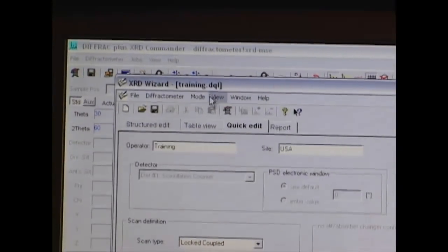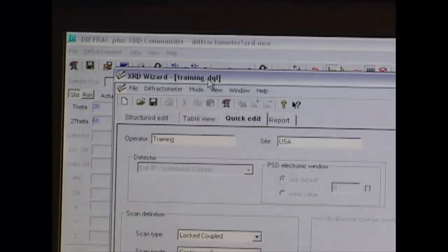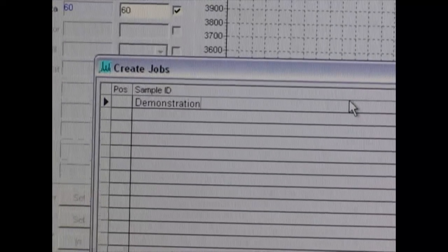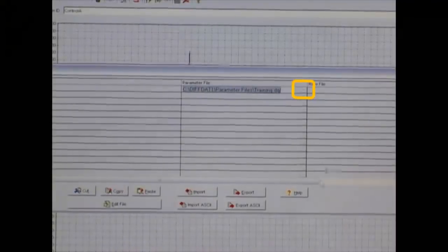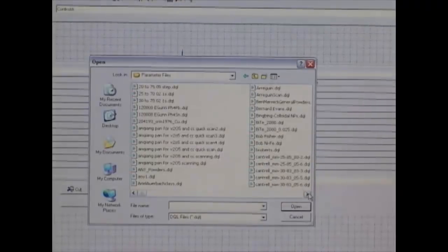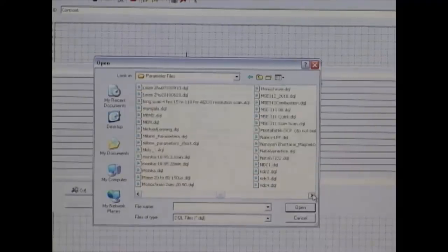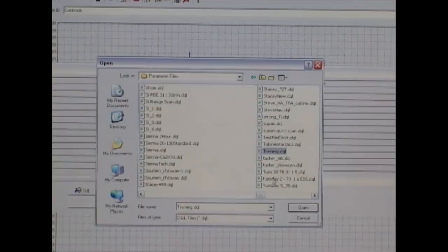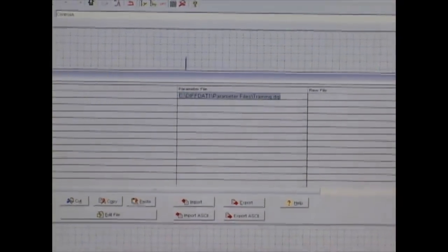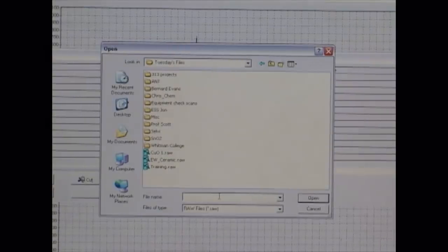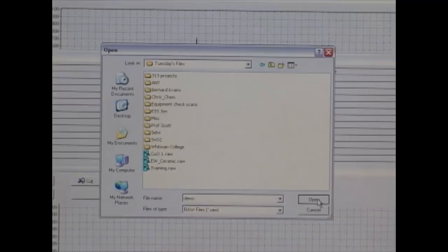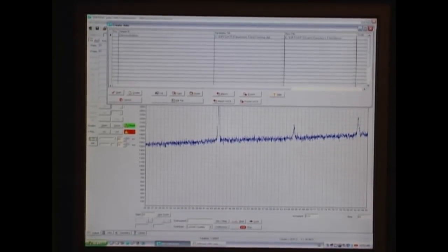So once you've filled all this in, you can just save it as your name and it will automatically put the .dql extension on it and save it in the scan parameters file. And I'm going to create a job. And there's a little button here that will take me to the file folders. I want to go up one into parameter files. I'm going to select my training. And then my raw file. Select that. And most people have a folder they've created for themselves. And demo.